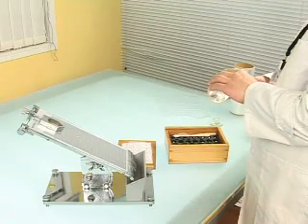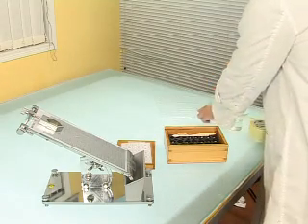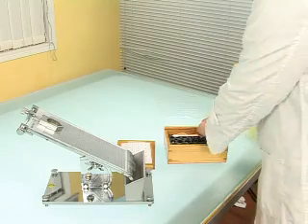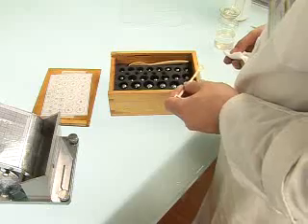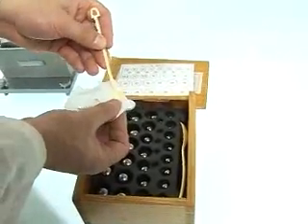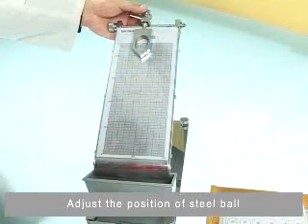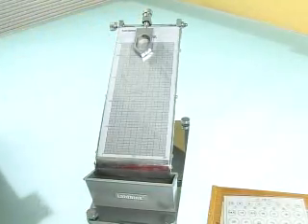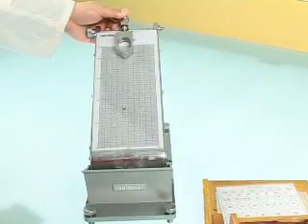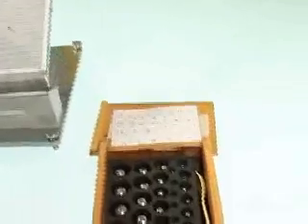Clean the steel ball. Adjust the position of the steel ball. Release the ball and find the biggest ball which could be stuck.